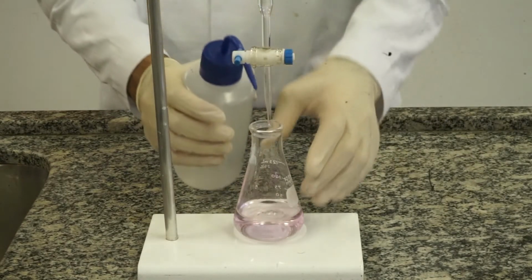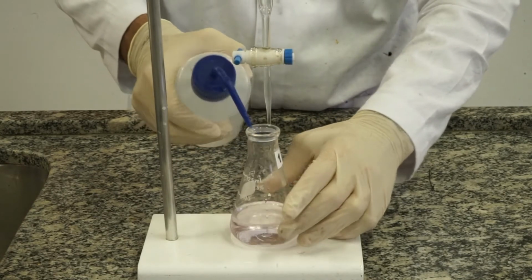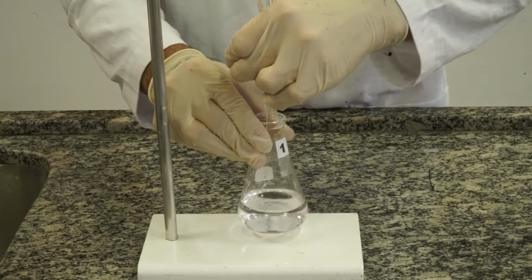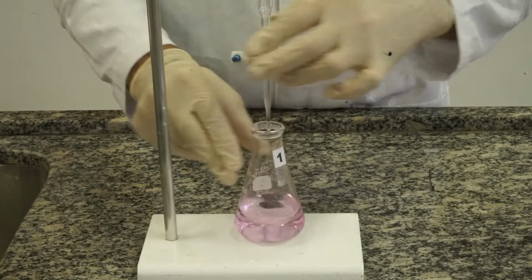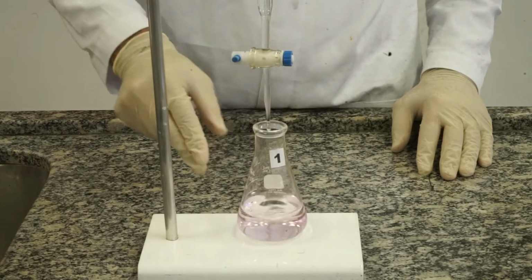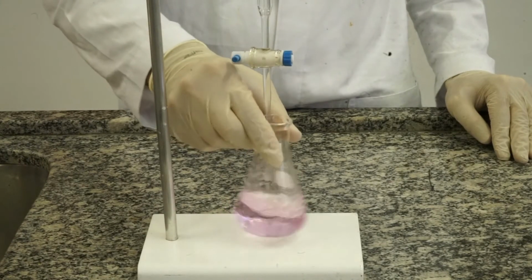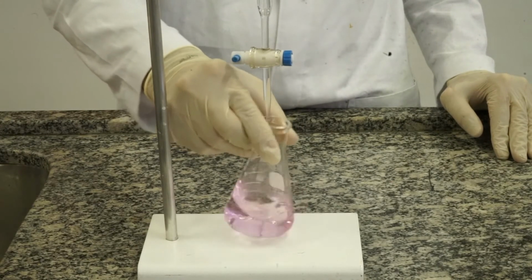Let me wash the inner walls of the Erlenmeyer flask. Distilled water will not change the number of moles. You can add without worry. That is the pale pink that we want. This is indicating the endpoint of the titration.